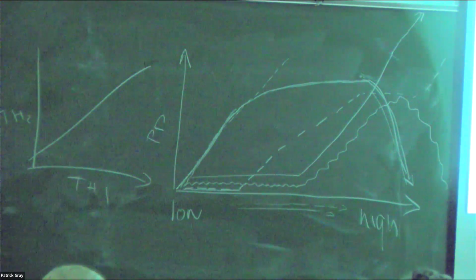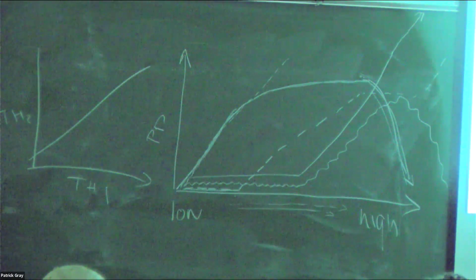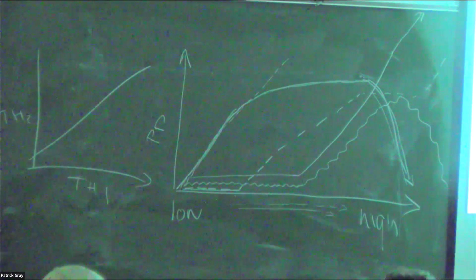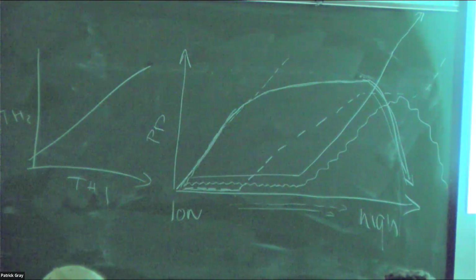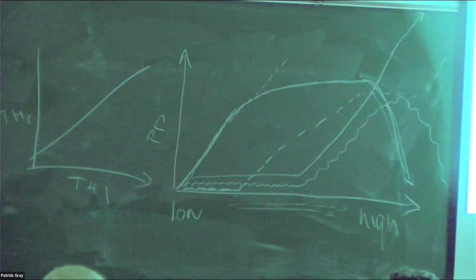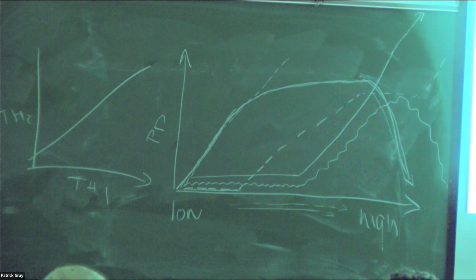To put it in everything, and this is probably the point where you're having that 60-35-5 ratio. Everything is saturated, but I can still keep it going, and then there's so much excess light that you're gonna destroy everything you have.